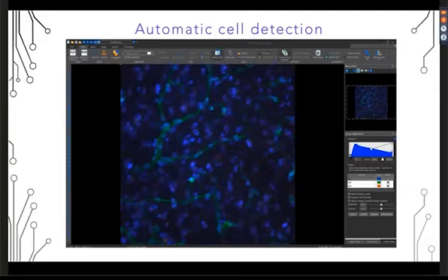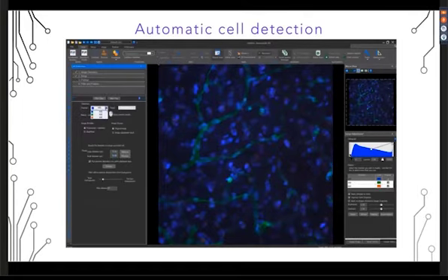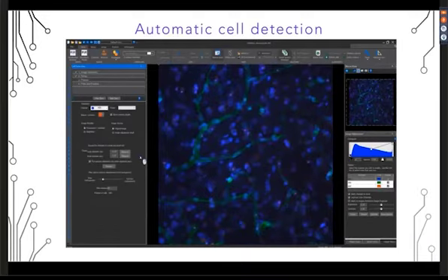Another segmentation tool that can be used to enrich your FAIR segmentation data file is the cell detection feature. To start, click the Detect Cells option and choose whether you'd like to detect cells in 2D or 3D volume. Next, choose the first color channel you would like to detect in. Filter the cells by size, choosing the largest and smallest cell diameters. Now, preview your marked cells on a single plane of the image.